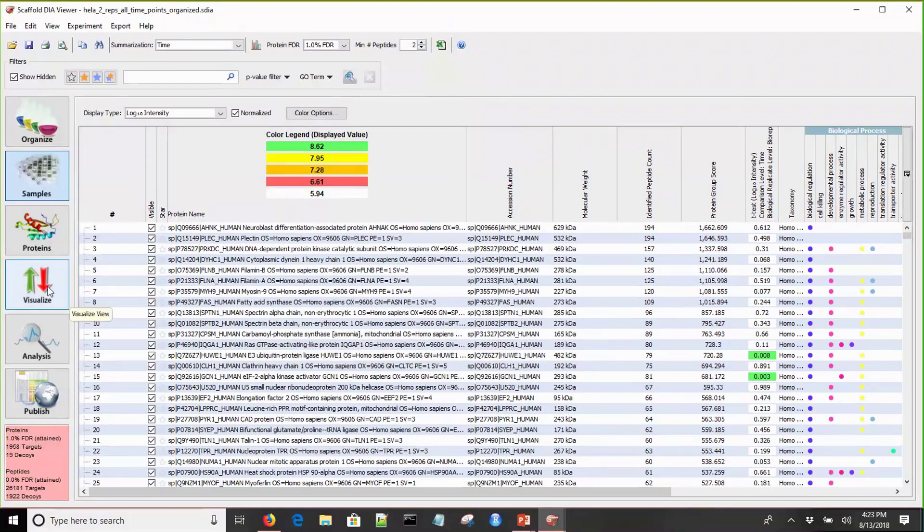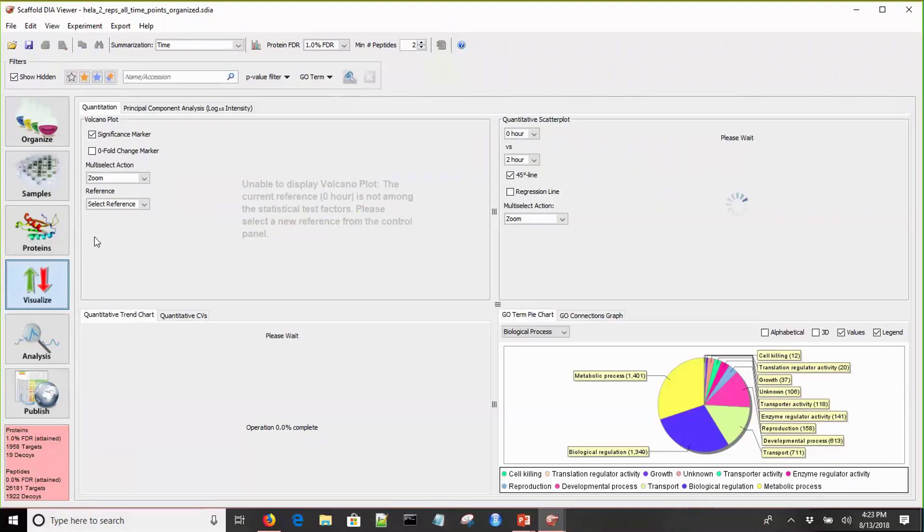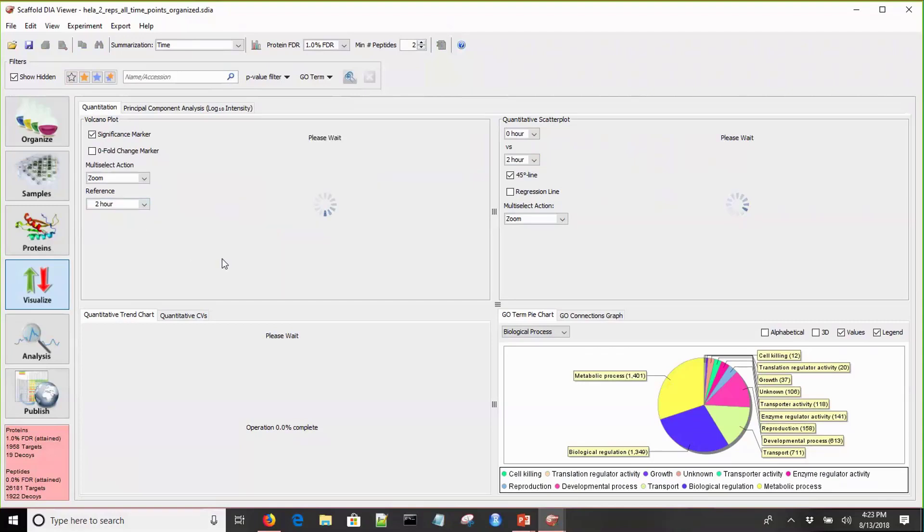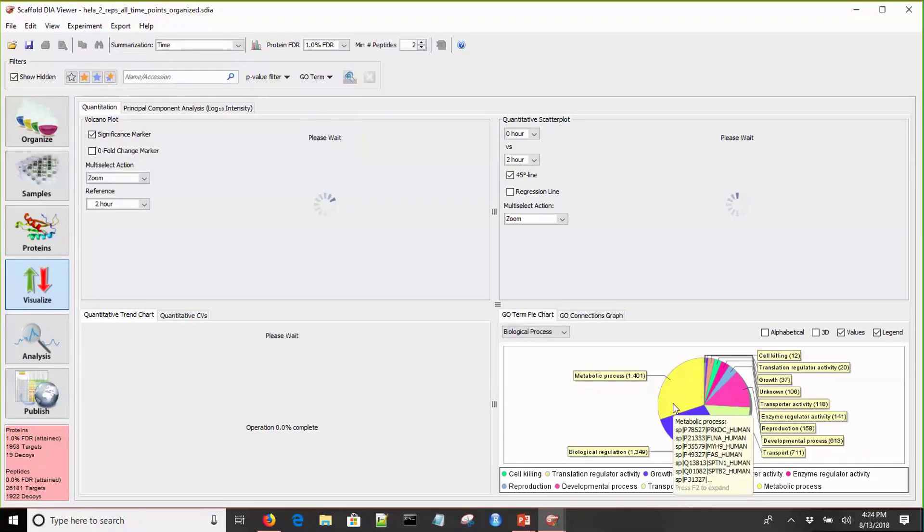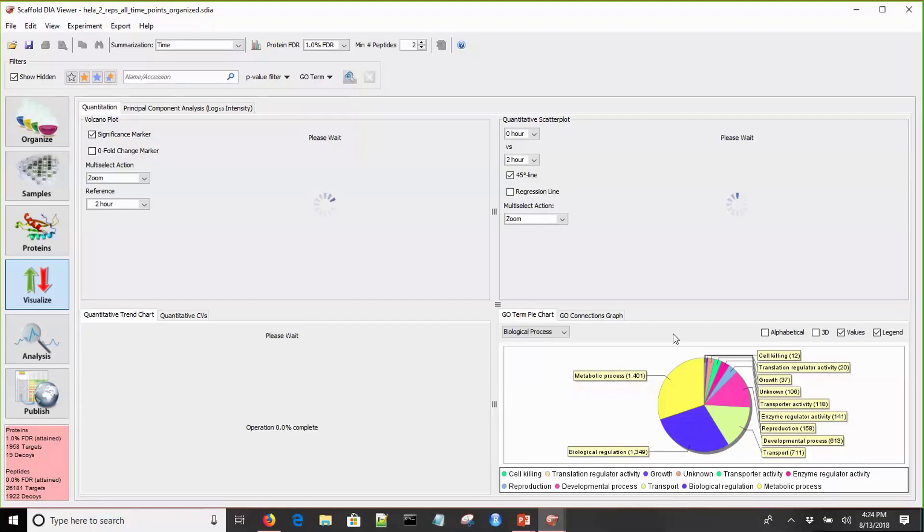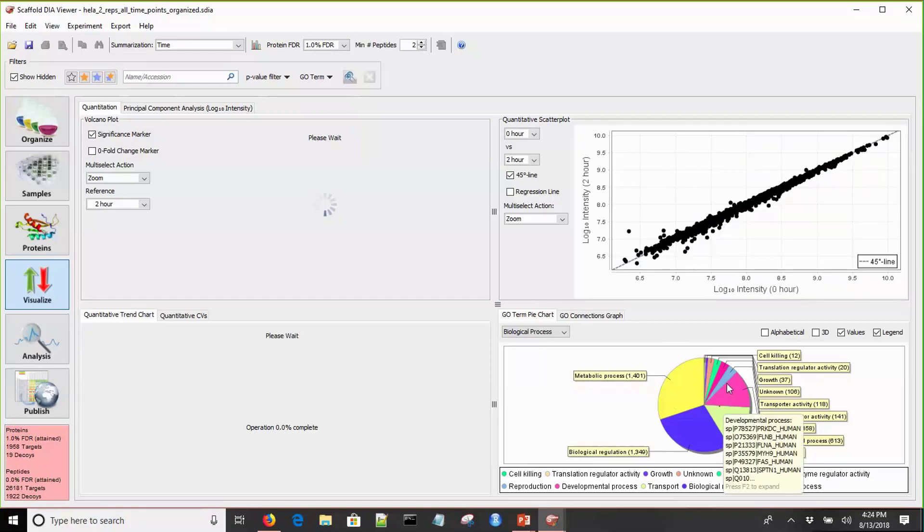Now that we have the t-test values, let's take a look at the volcano plot. We'll come into the visualize view. We have a couple different plots here that I'd like to show you. While the volcano plot is building, we have a quantitative scatter plot, which shows the values between two of your samples, so you can look for outliers to see if there are any proteins of interest that you want to interrogate further. Then down here we have a couple charts related to GO terms. I have the GO terms already applied, and I'll explain how to add those in a few minutes. This is a pie chart that shows the total number of proteins in each GO term group.